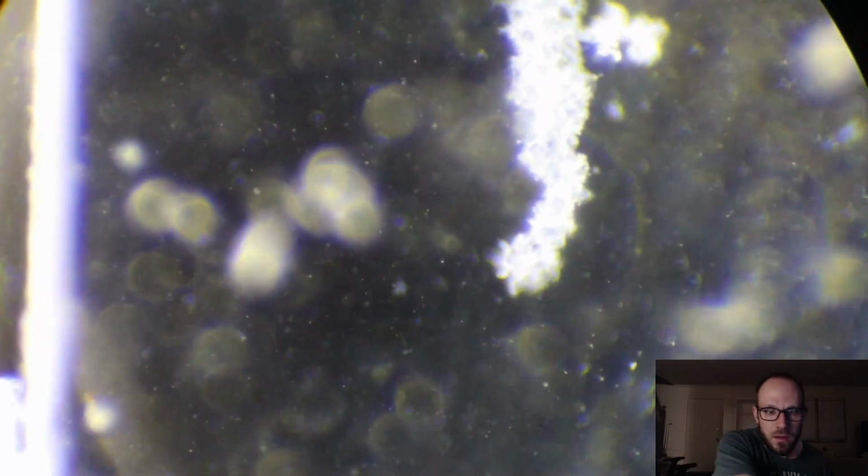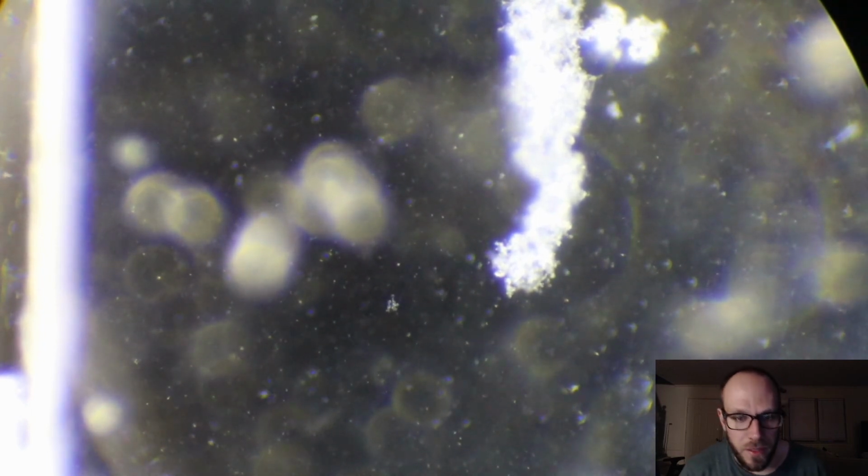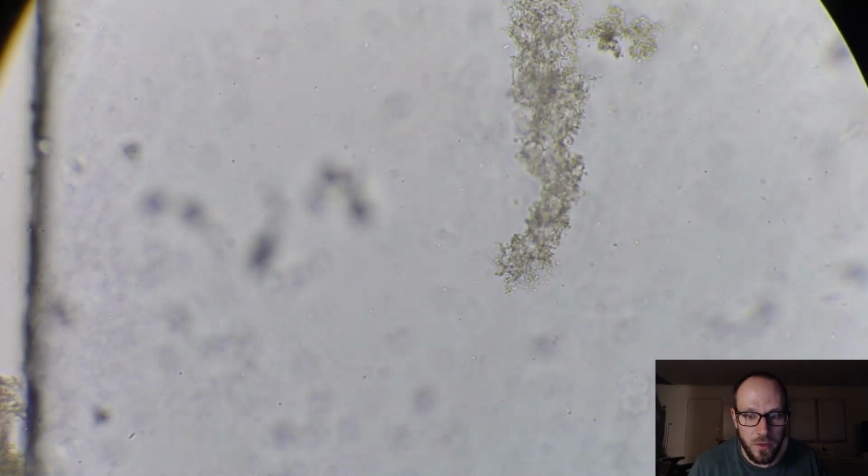Let's go to 100x and see what we can divine. Oh, yeah, this is the same guys. I want to think they're algae. And as you can see, they keep swimming in and out of the plane of focus, which is very thin. I can take off the dark field here, and it will thicken up that plane of focus somewhat. Let's get some contrast going. And you can just see, yeah, they're just swimming around.